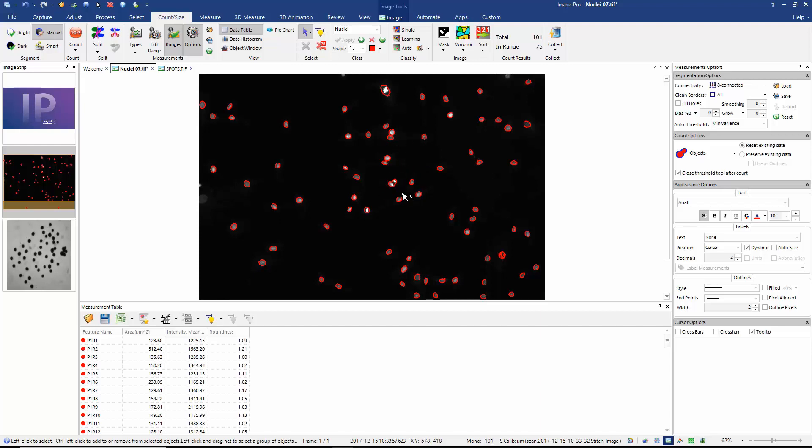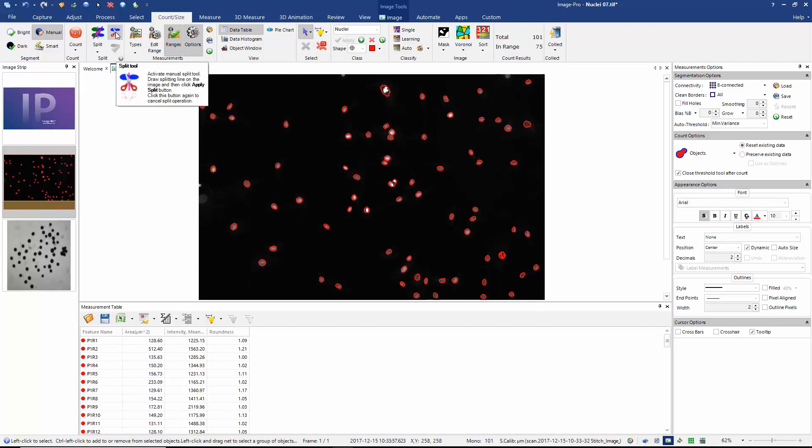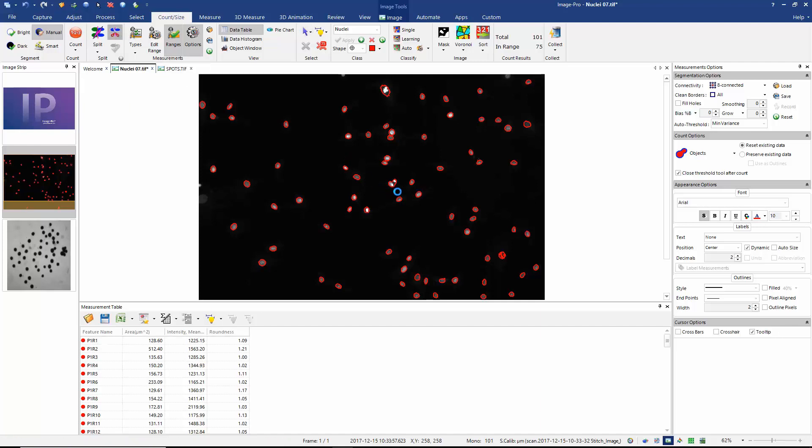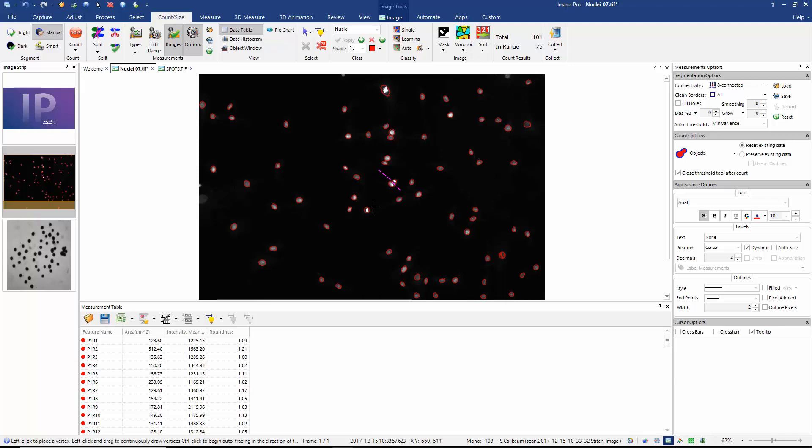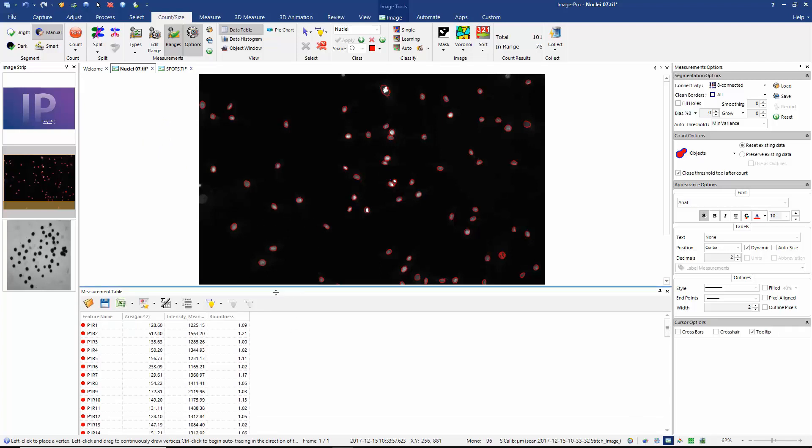I still see a pair of objects that are joined here. I think this is the only pair that is still joined. So I'm going to manually split them. I'm going to take this split tool, and with a left click, I can start a line between these objects. I'll double click to finish my line. And I've manually split them now into a pair of objects. So now I've got a table in which I can see all of my objects correctly measured.